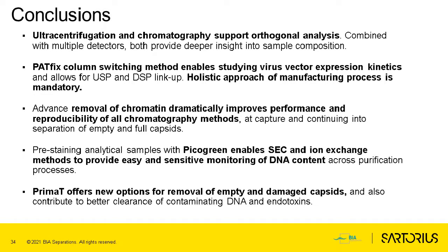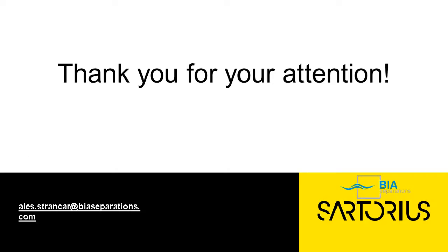And we need new columns, we need new chemistries, new ligands to even have better separation of empty and full, not really empty and full, but also of either truncated or however we call the capsids, which are not really our product. With this, I would like to thank you for your attention, and I'm happy to go through the questions which you may have during the presentation. So thank you very much.